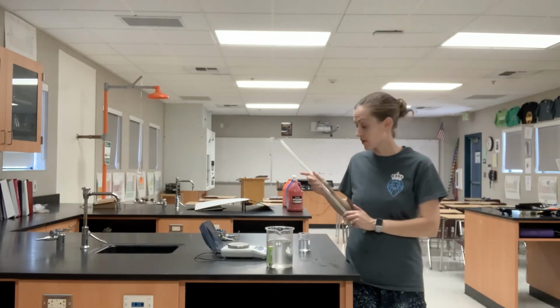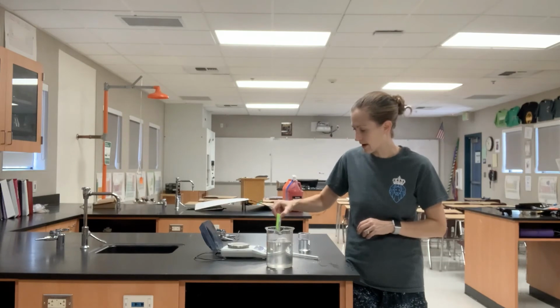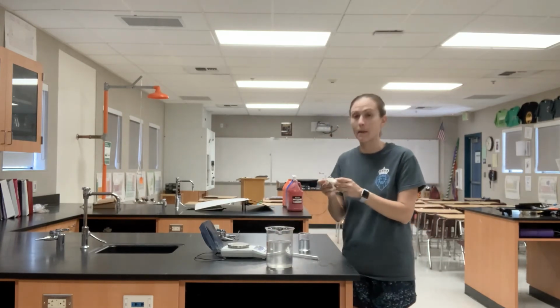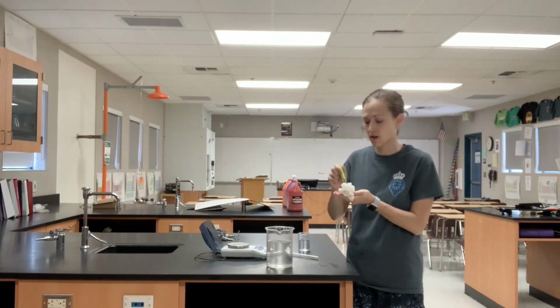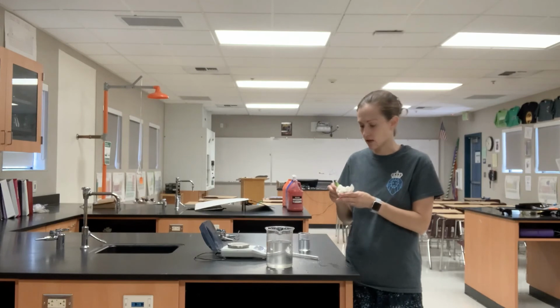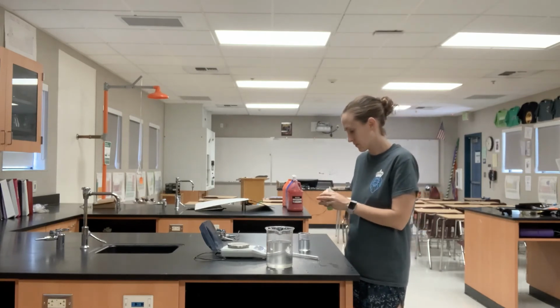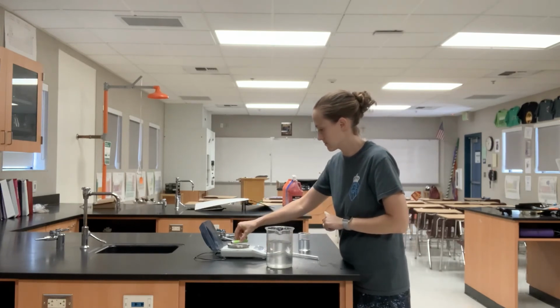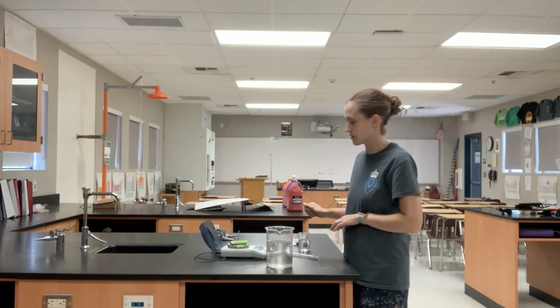So I now know the volume of gas that I released from the lighter. And so what I need to do now is figure out, okay, what mass of gas did I release from the lighter? Because the goal of this lab is for you to determine the molar mass of the gas. So I need to find the new mass of the lighter, so I'm going to dry it. Okay. And I'm going to zero my scale again. I'm going to put my lighter on my scale, and then I will have you read the new mass.